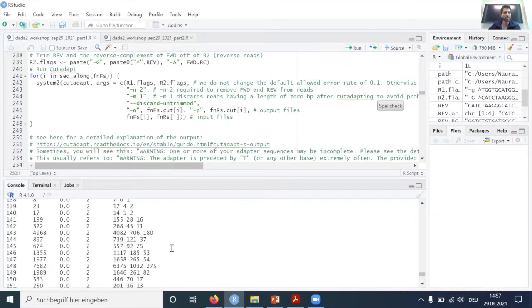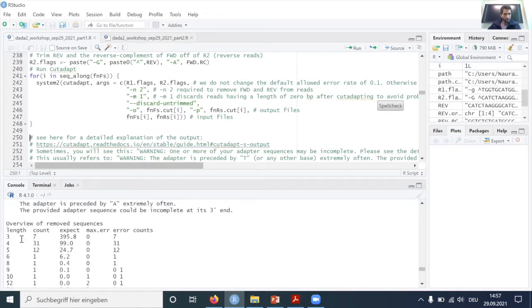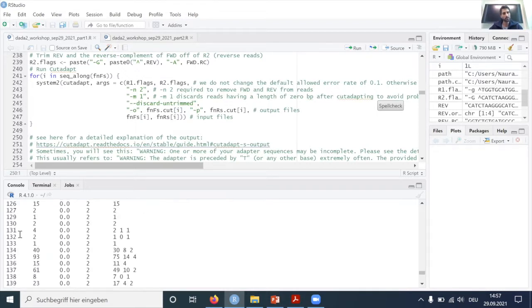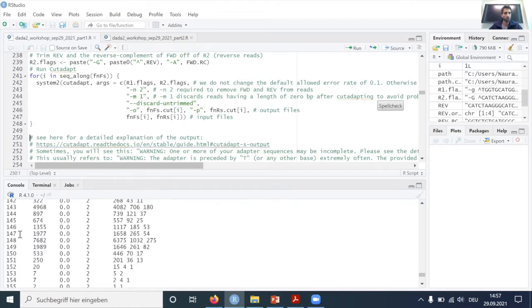And now you already see this is a bit different here. Because we have found different fragments now in our reads, depending on where the primer was found and where it's been cut, different sequence lengths have been removed. Okay, so far so good. So we probably see that the majority of our reads, or our amplicons, are around 150 base pairs long for our 18S, and not 300-something.